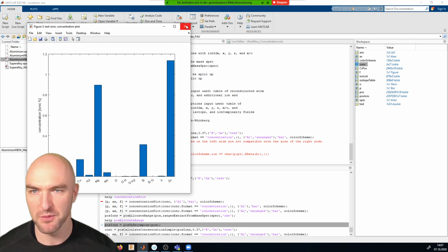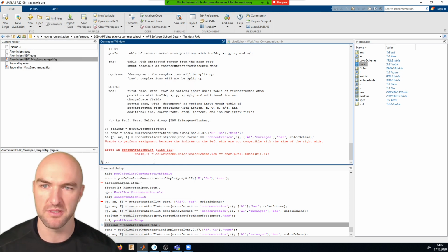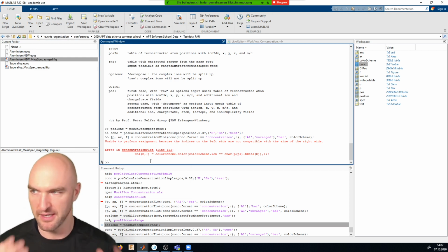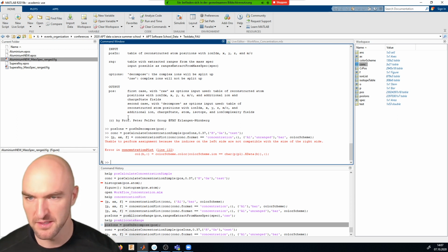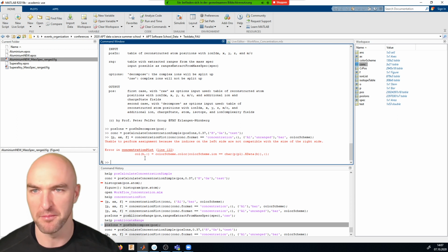And this will actually work for all different steps during the analysis, that it automatically will know that if you have an undecomposed, a raw or just ion defined pos variable, that it knows that you want to do analysis with ions, and that if you have an atomically decomposed one, it will give you everything on a per atom or chemical element basis.